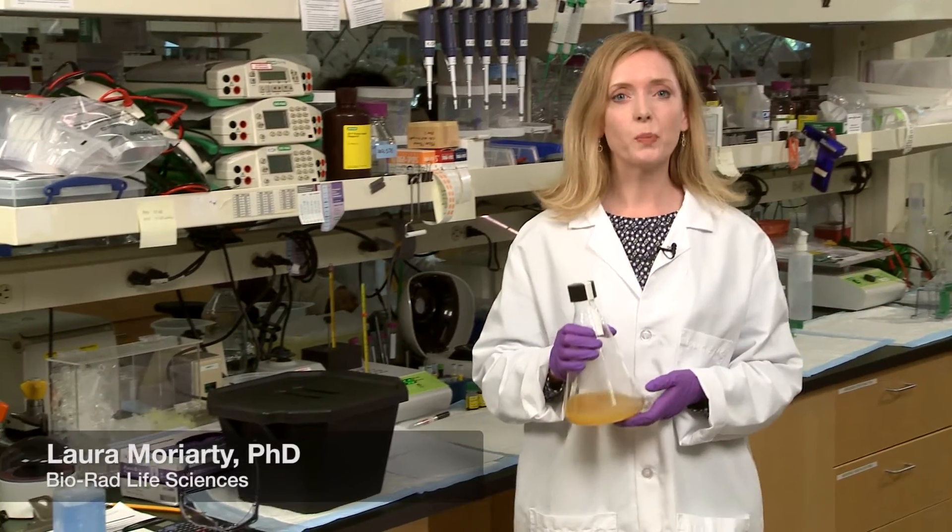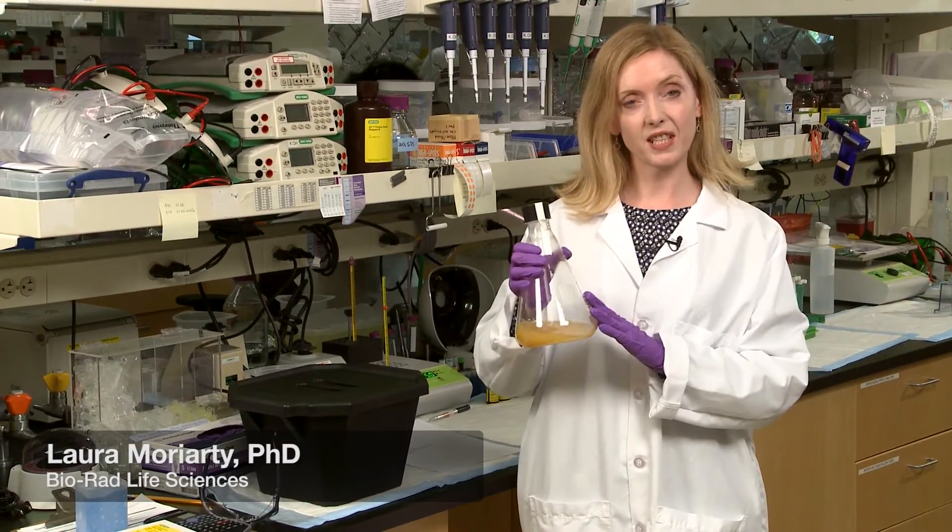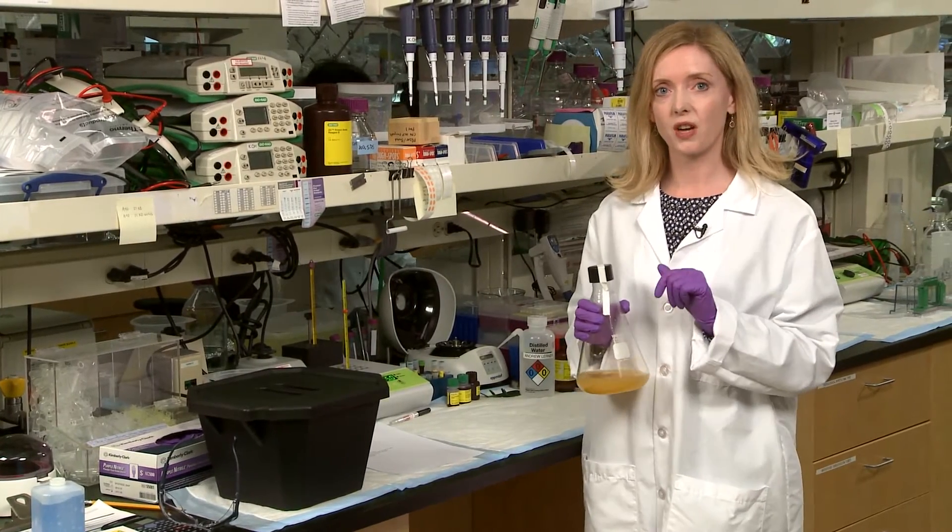Are you getting ready to prep your sample but don't quite know how to get from this to something you can run on a gel or an FPLC? Well, we have four tips to get you started.